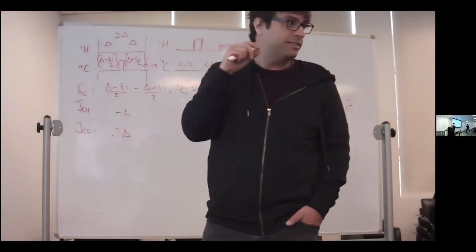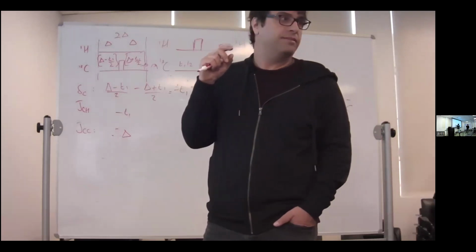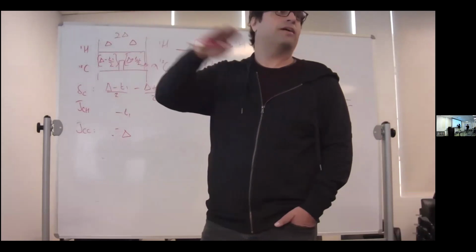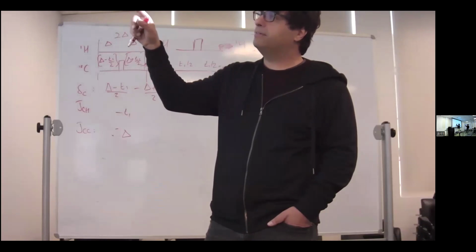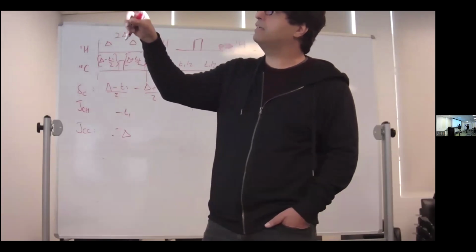Oh, this is not constant time. Here, it doesn't look like it. It gets rid of carbon compounds. Oh, so it is constant time for carbons. Yes, this should be delta, it should be constant, but it looks like it's not.